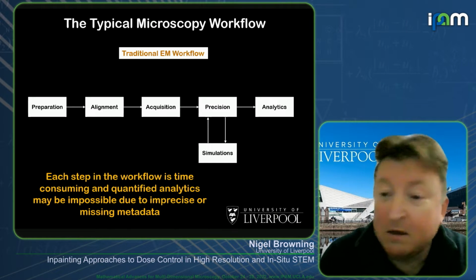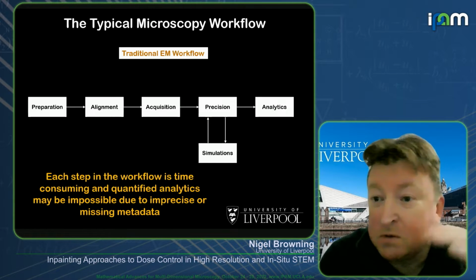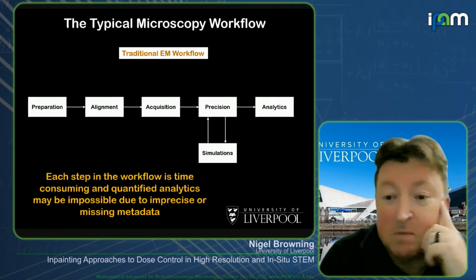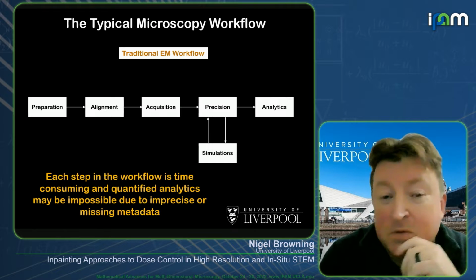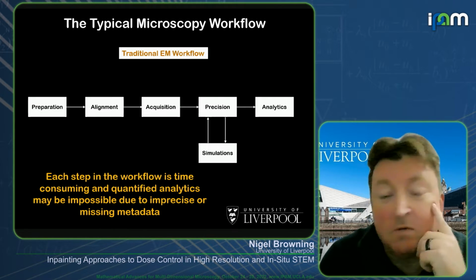That analytics might be looking at the image and saying, oh, there are some dislocations there, and these are the dislocations, or it might be a distribution of sizes, a temporal resolution, or a change that comes out of it. But effectively, that's what we're trying to get out of the final experiment: the actual quantified result telling us what is going on.